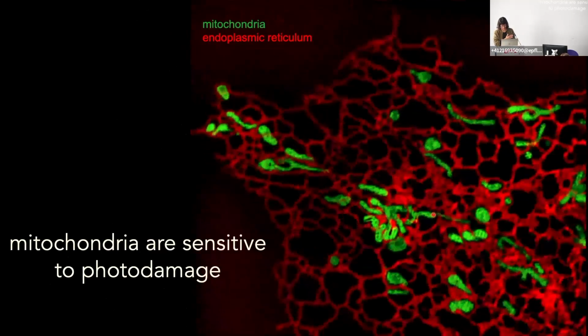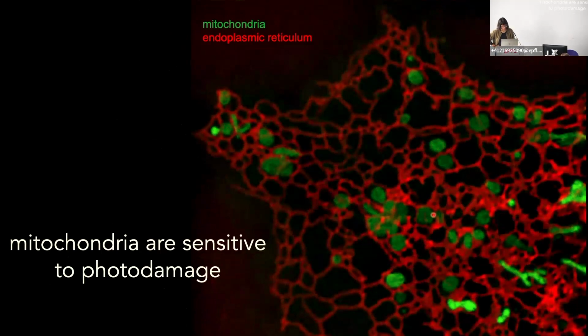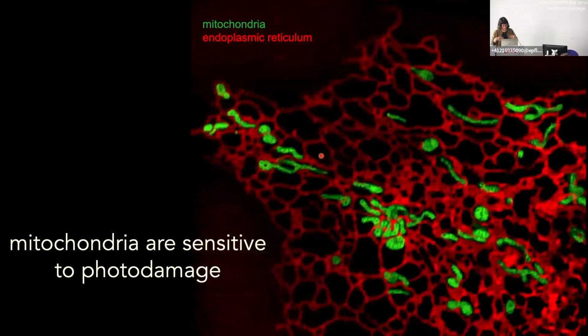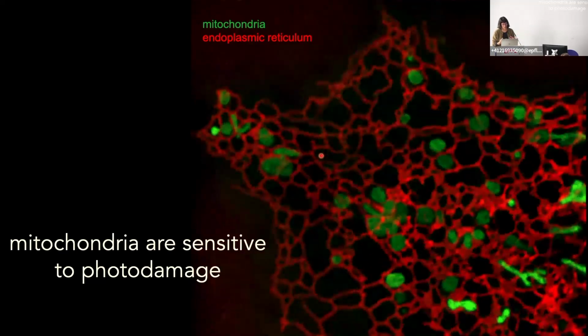Here, we're imaging mitochondria. This is a sensor of mitochondrial membrane potential, and you can also see the endoplasmic reticulum in red. These two organelles communicate with each other via calcium signaling. Over the course of this movie, you can see that the mitochondria change their shape. They lose their internal structure. They lose their membrane potential, which is seen as a diminishment of the green fluorescence. All of these things are issues that we run up against when we're trying to capture the life cycle.